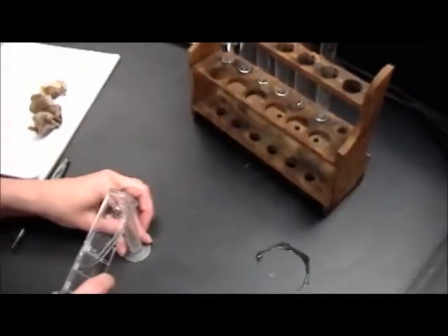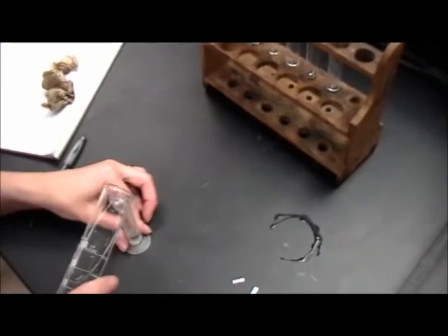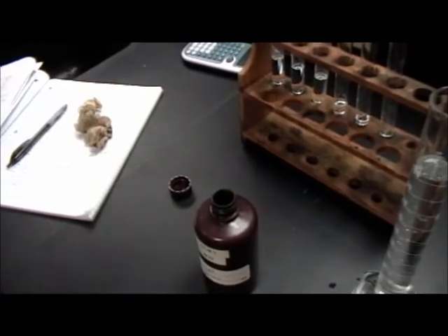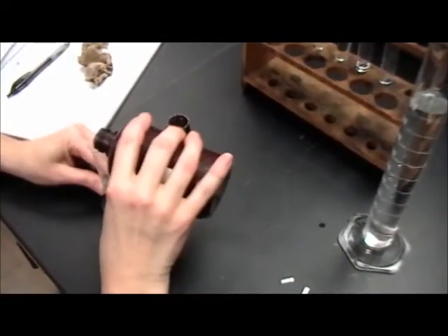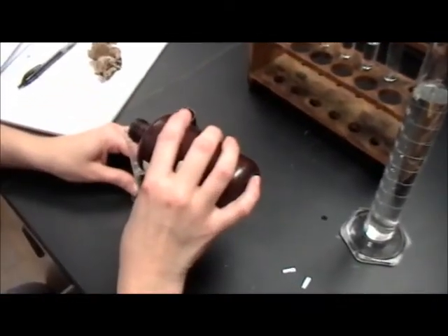You'll take the hydrochloric acid and you'll take a series of test tubes and add the appropriate amount of water to each as shown on the experimental sheet, and then add the appropriate amount of acid each time. Mix each test tube individually, and you'll then have the appropriate molarity in each test tube. The molarity just being a measure of the concentration.